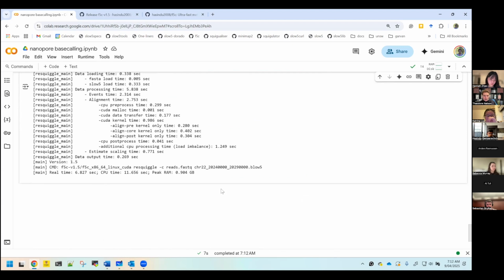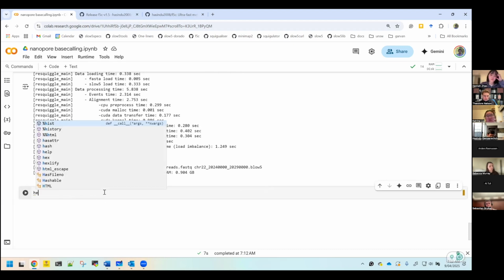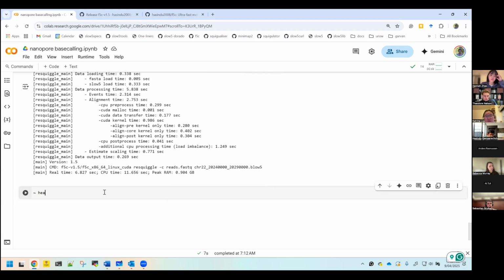Could you describe the PAF format? Yeah, so the PAF format is a simple pairwise alignment format. That's what it stands for. It was introduced by Heng Li, the Minimap author, some time ago. Now, let's take the head of the file.